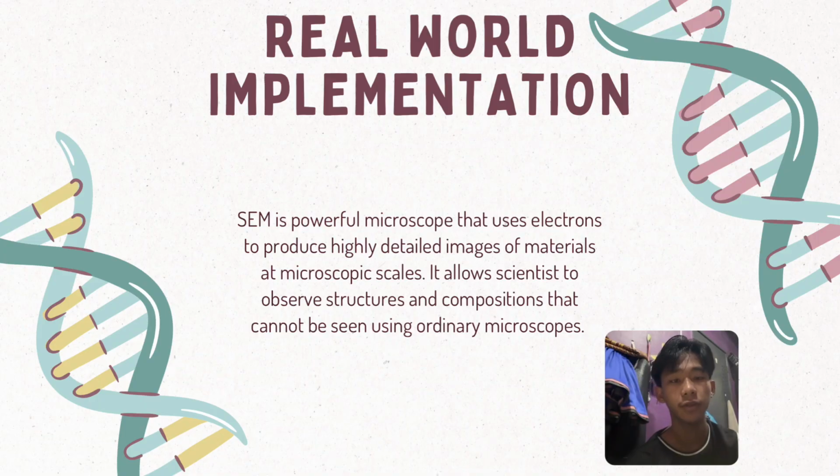Let's shift our focus to real-world implementation. SEM is an incredibly powerful tool because it uses electrons rather than light to produce highly detailed, high-resolution images of materials.